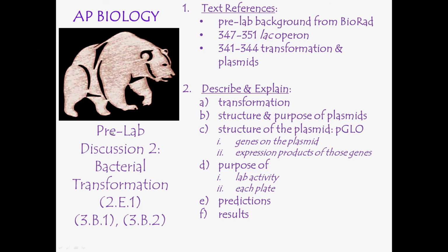This one is on the pre-lab discussion 2 for the bacterial transformation. So at this point, you may or may not have already done the lab by the time you're watching this. But by the end of this, hopefully you're able to describe and explain what transformation is, talk about the structure and the purpose of plasmids, and so defining what a plasmid is.